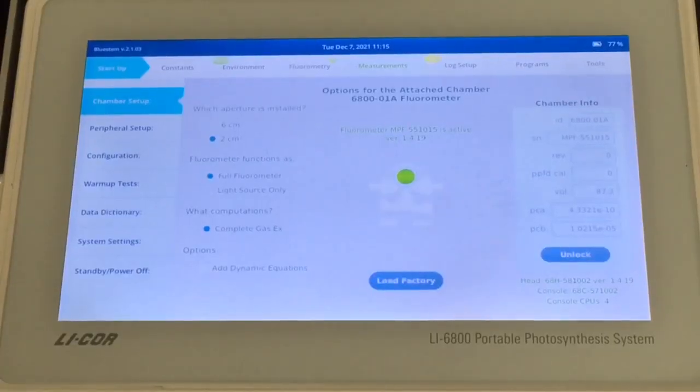And next here, I will do a little experiment to just determine the stability criteria on a plant. So to determine my stability criteria, I've picked a greenhouse grown corn plant that I've clamped on. It was originally dark adapted, but I've increased the light intensity to about 500 micromoles of light, and it's sitting in this chamber acclimating to this new light set point. So I'm going to use this plant to determine my criteria.